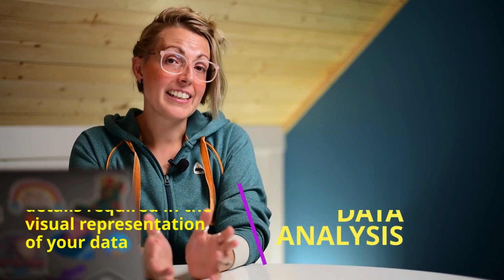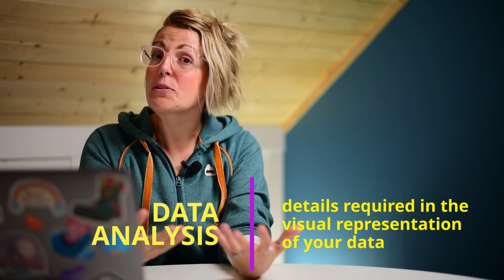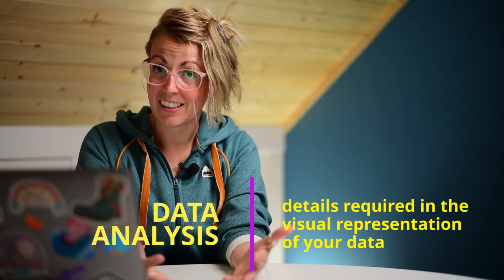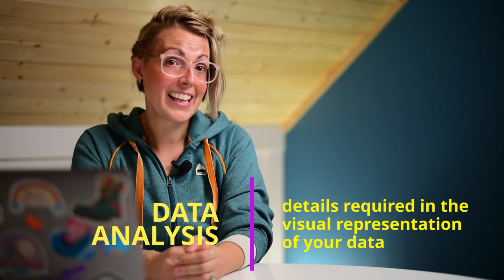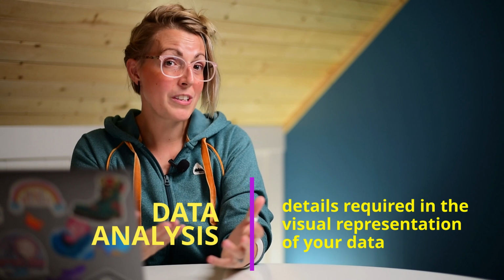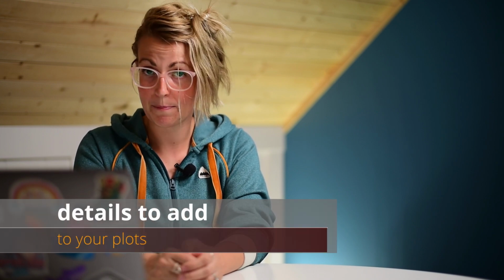And finally, data analysis. This is the part that really draws the attention because this is where you start presenting your data. Now, like the other sections, a lot of the times you may find this lacking in detail to be able to assess what's truly happening on the plot. So your publications don't fall victim to this, a few things I would recommend adding to your plots all the time.